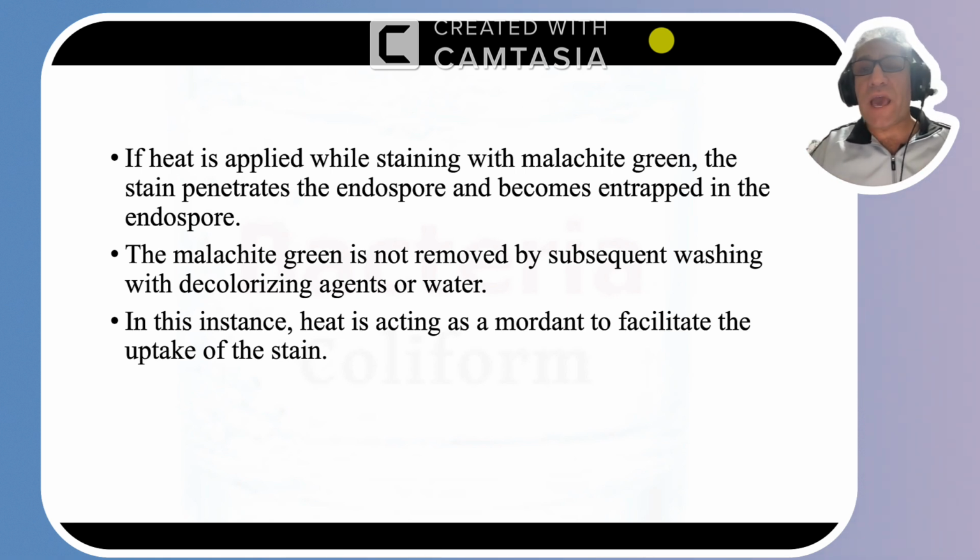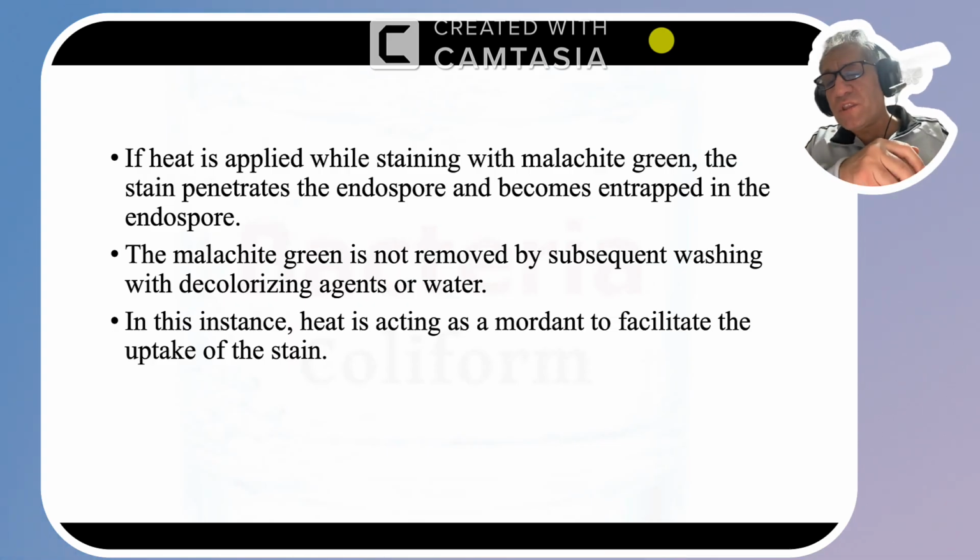Malachite green will penetrate the endospore and color the spores green, after smearing. We're going to talk about it in the procedure, of course.